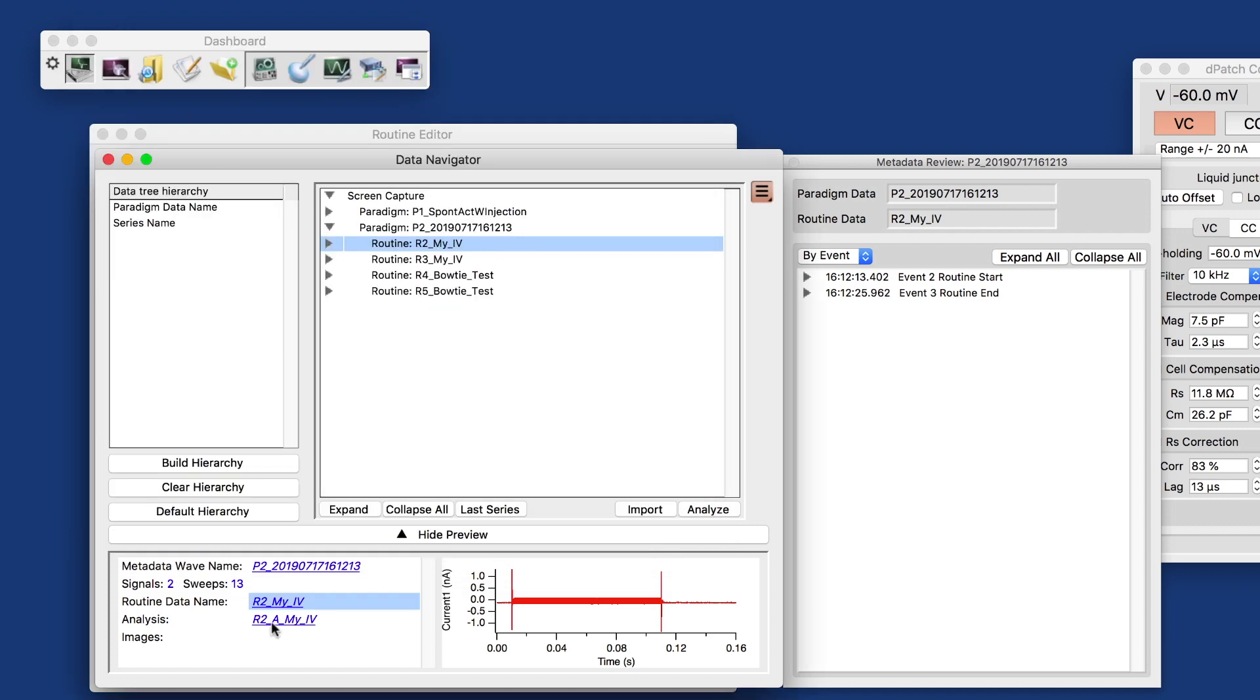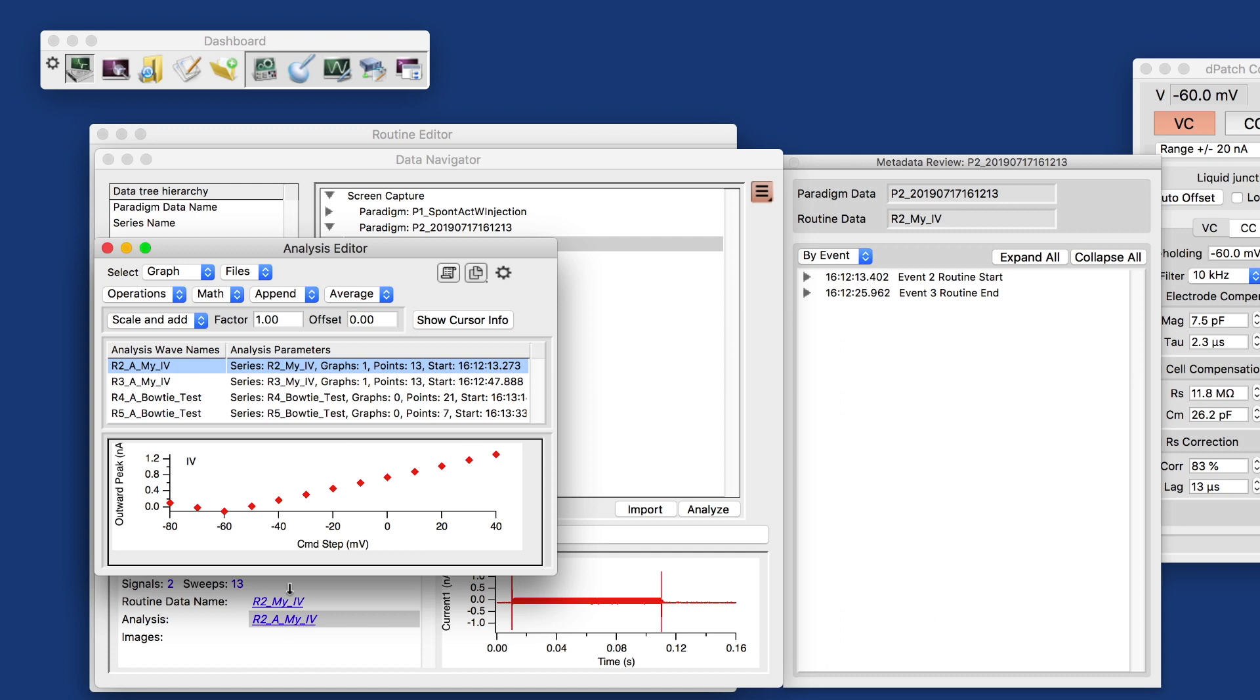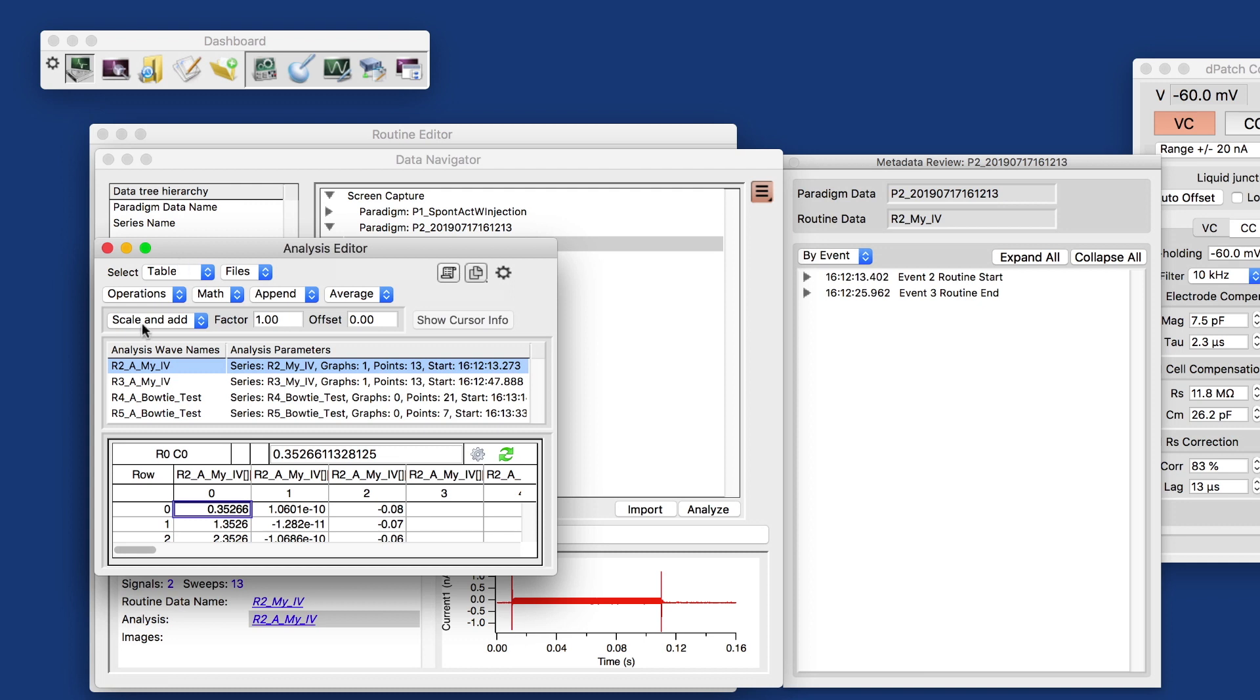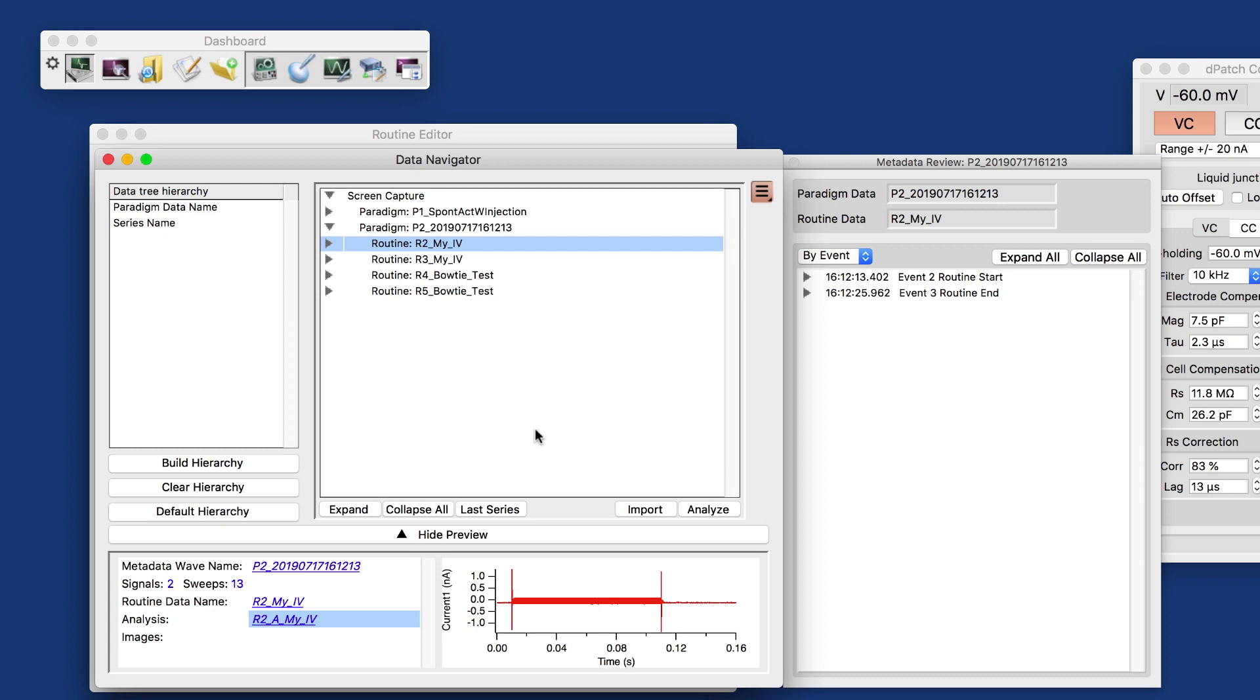Anyway, we also have the analysis associated with, in our case, the MyIV, the IV curves. You can look at that. And you can look at the graphs or the table. You can scale and add that, append, average, et cetera.